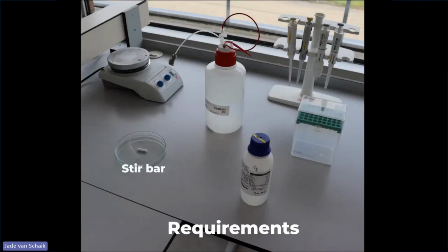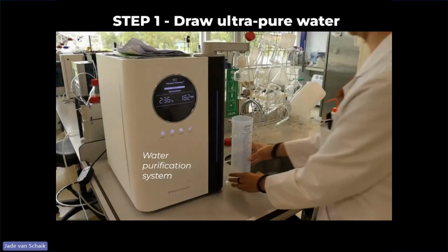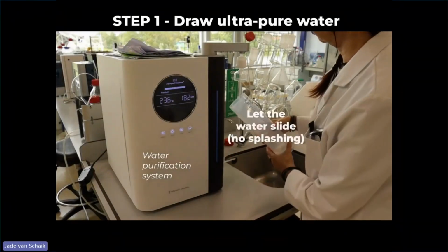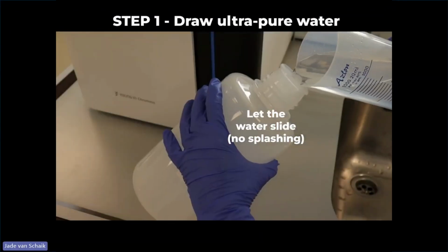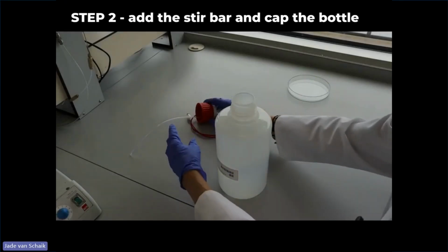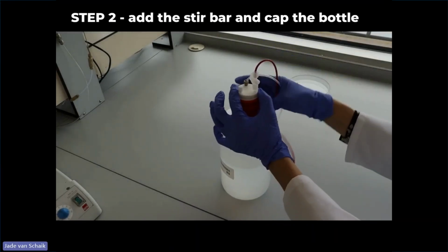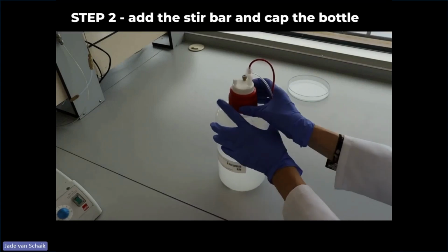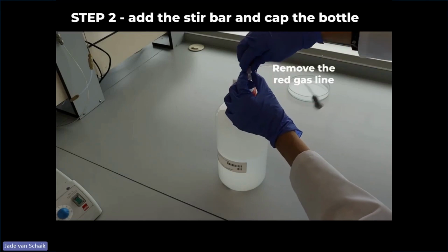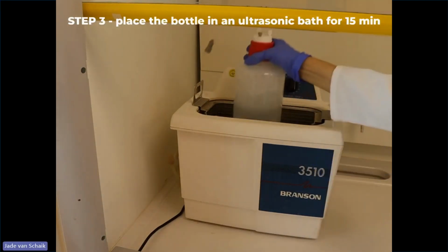We need a stir bar, a magnetic stirrer, a dedicated bottle and cap, a pipette, and of course the carbonate-free 50% sodium hydroxide solution. We start with drawing some ultra-pure water without splashing and pouring it gently into the bottle. Then add the magnetic stir bar and close the bottle with a cap. The red gas line is not needed now, so we can remove it. The next step is to place the bottle in an ultrasonic bath for 15 minutes.